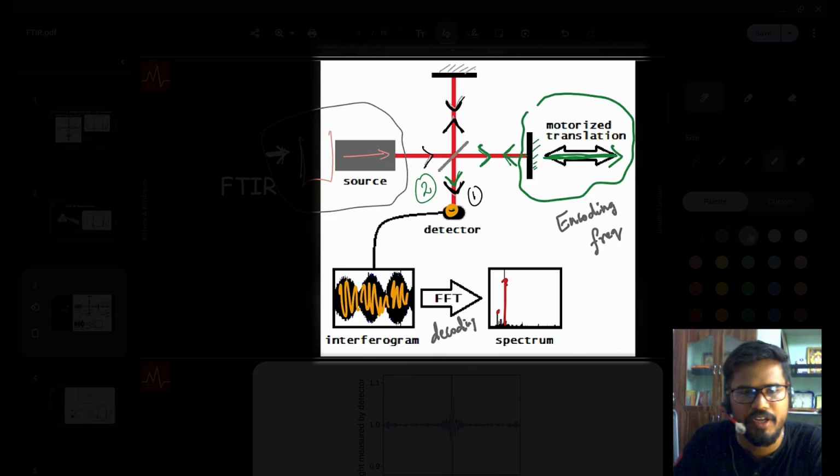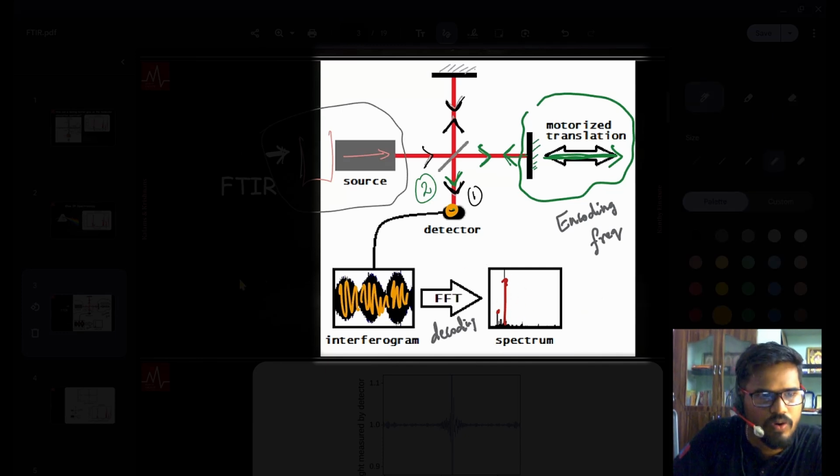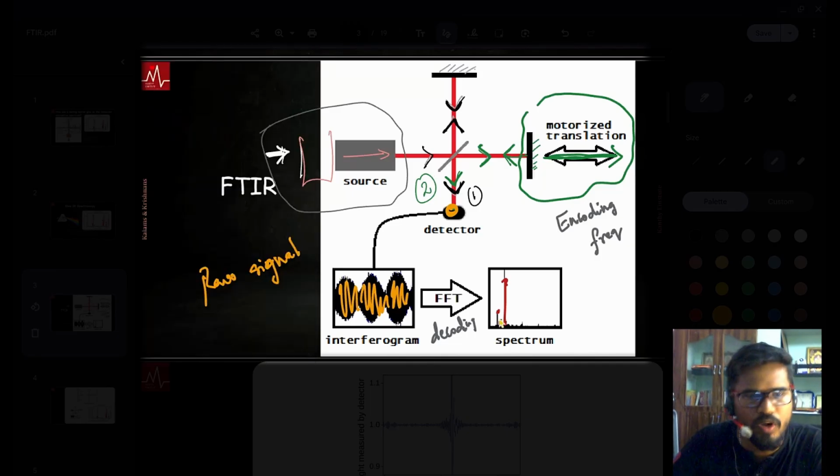To think about it another way, if what you are getting is a spectrum, the raw signal that you are getting is roughly a summation of all these sinusoids in the spectrum. So the raw signal that you have: take one component at a time, add all of them together, superpose them, you get the raw signal.